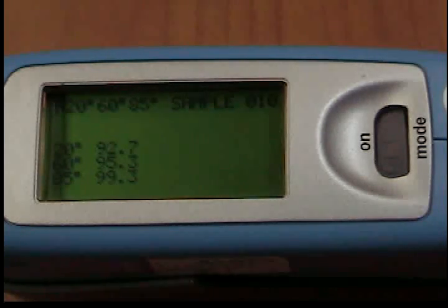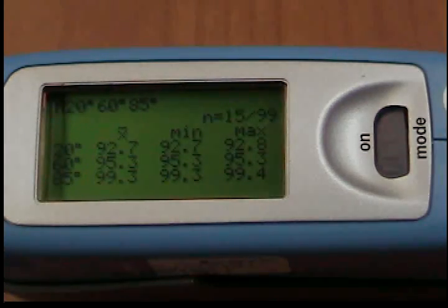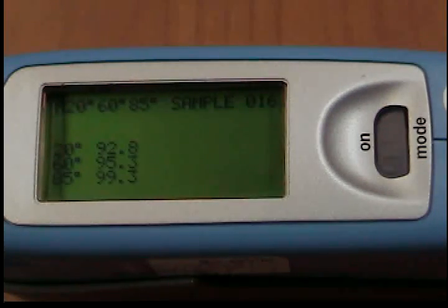You can interrupt the continuous measurement by pressing the OPERATE button. The number of measurements, the mean value, the minimum, and the maximum appear in the display. Press the OPERATE button to continue with the continuous measurement. To end the measurement, press MODE.